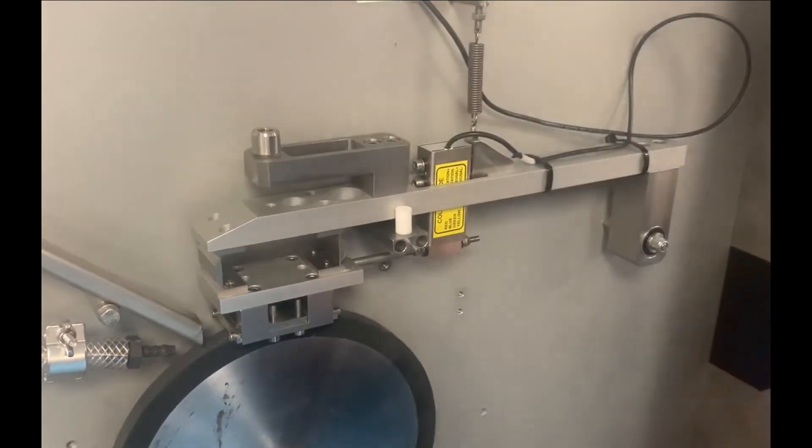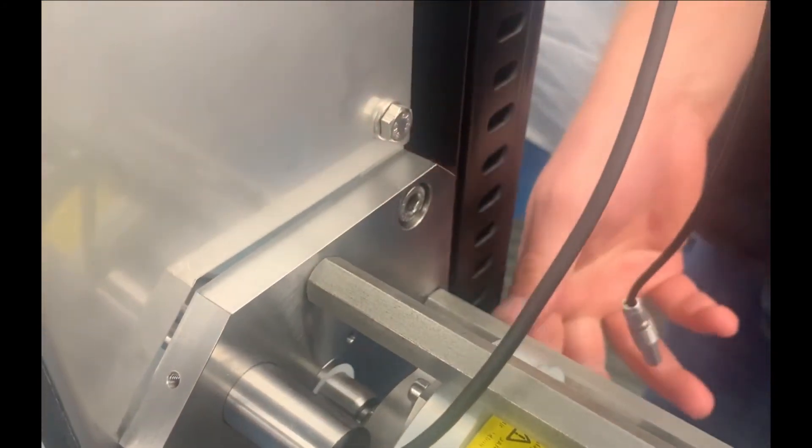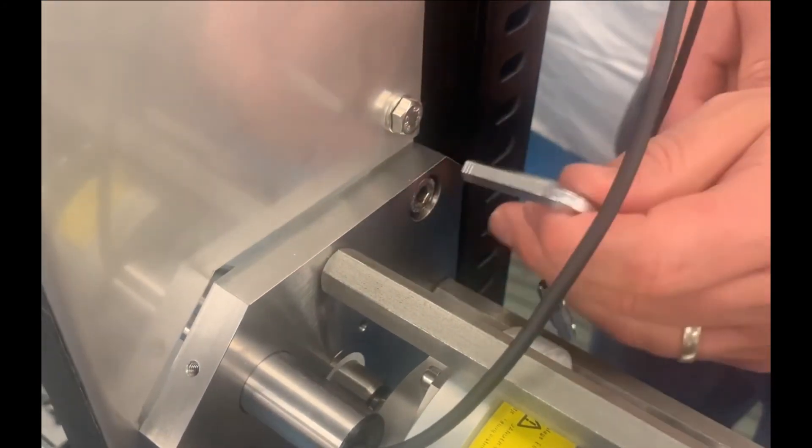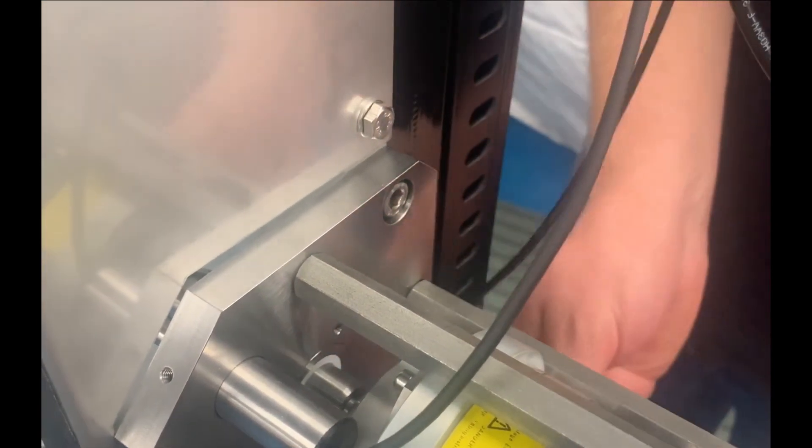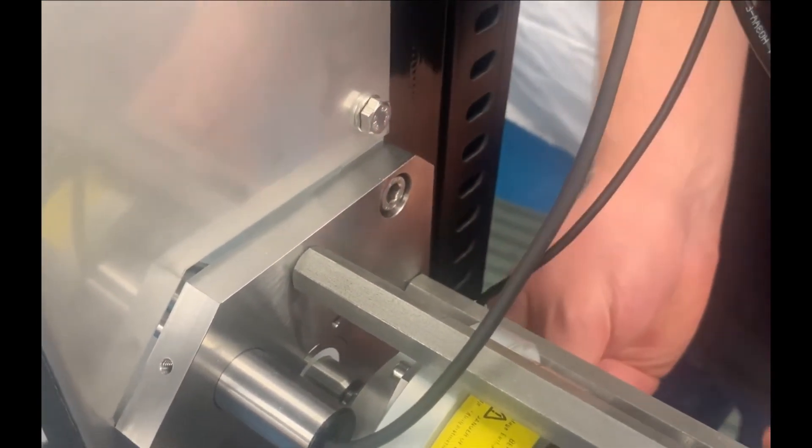To reposition the pneumatic load bellows, first disconnect the force transducer cable. Next, support the assembly and remove the cap head screws.